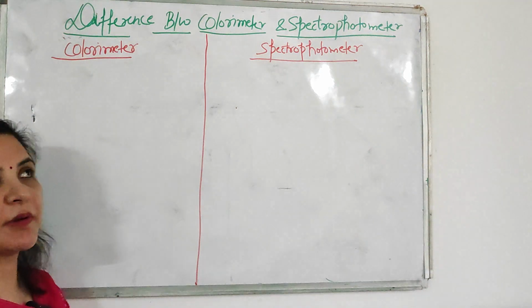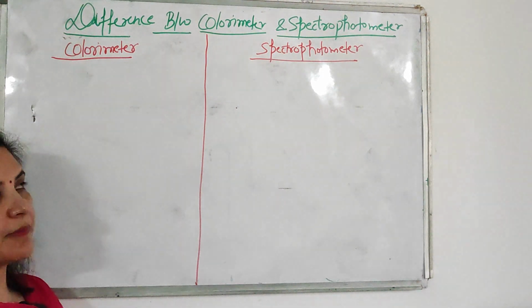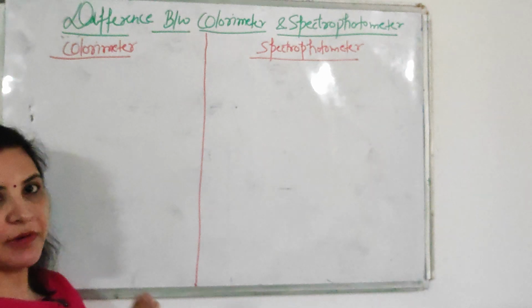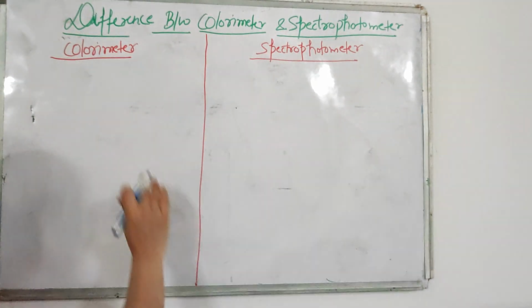So today our topic of discussion is the difference between colorimeter and spectrophotometer. This difference can be asked in a viva as well as in theory. So you must know the difference between spectrophotometer and colorimeter. Okay, so let's start the topic.